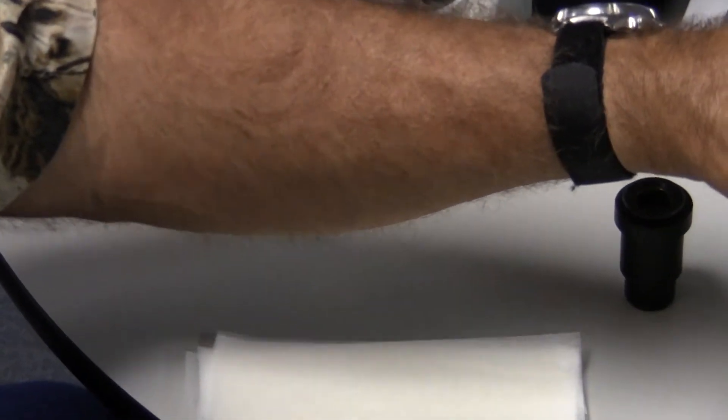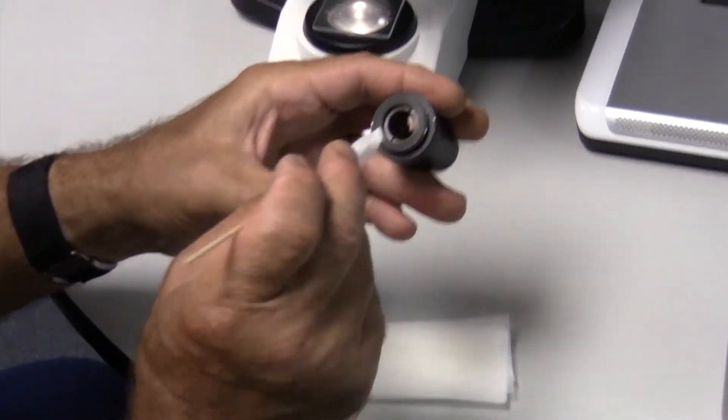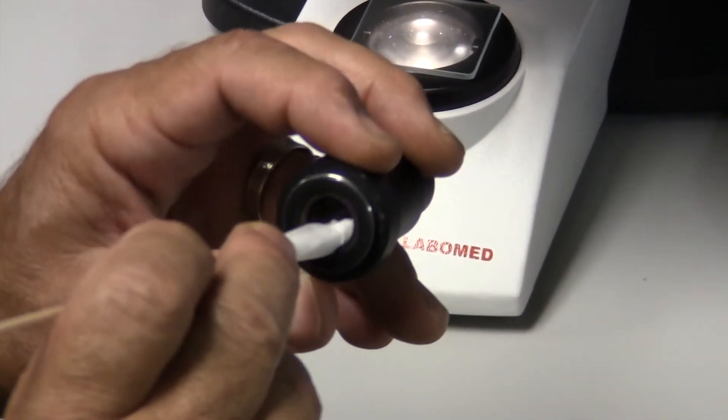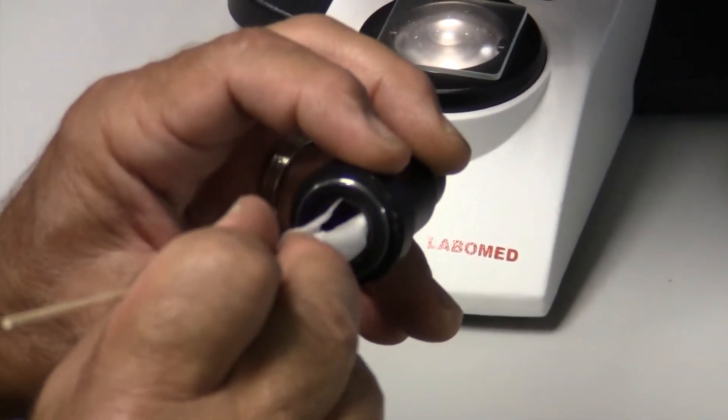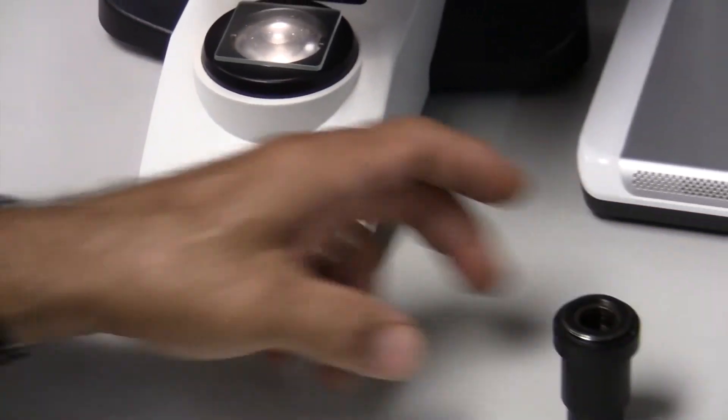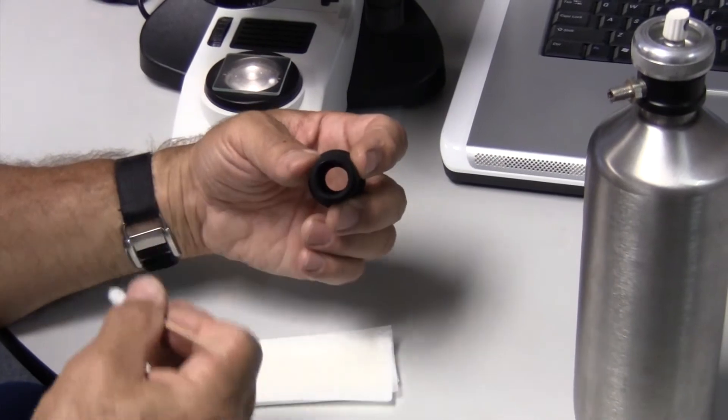Put a little glass cleaner on it, just to dampen it, you don't want it soaked. Lay it on the lens, and then carefully rotate the lens and the paper, working your way to the outside of the lens. And we're going to repeat the same thing on the inside of the lens.